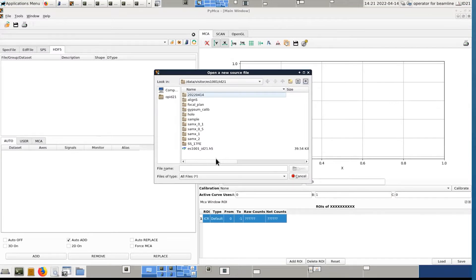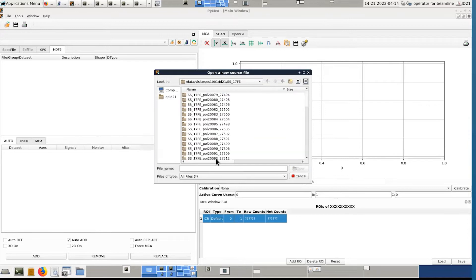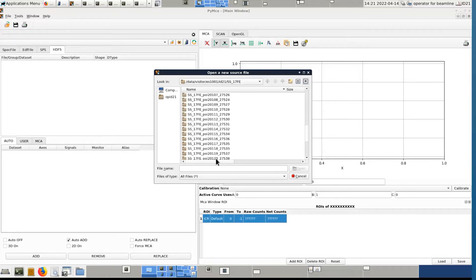So now we are working on this sample, SS17FE. So the data of interest are in this folder. So you could go in this subfolder for this specific sample to open data from this sample.